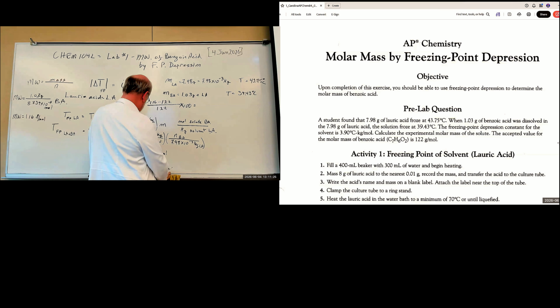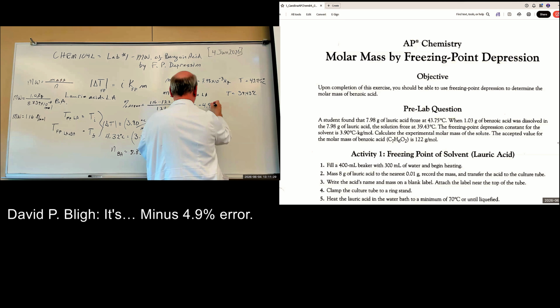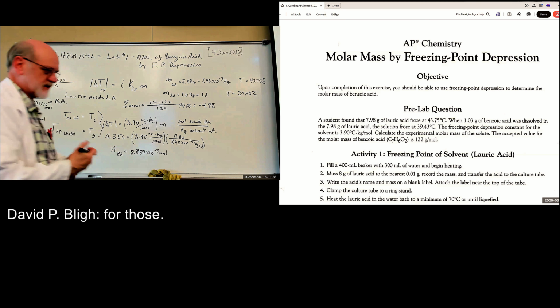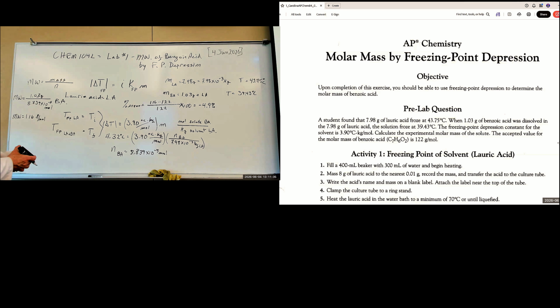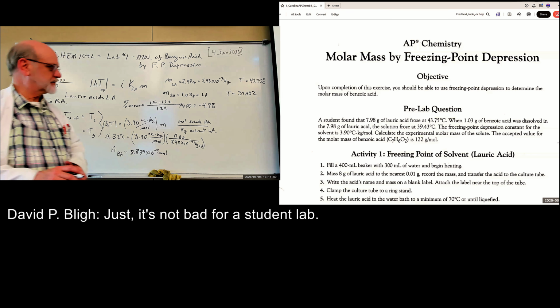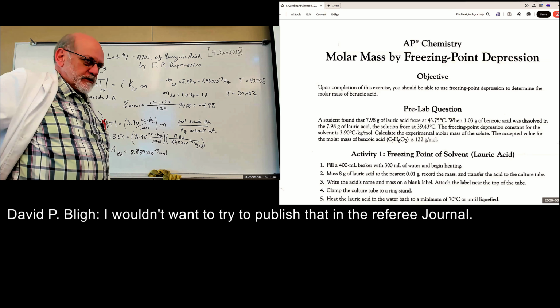It looked right. It's minus 4.9% error. Yeah, 4.9%. Okay. It's not bad for a student lab. I wouldn't want to try to publish that in the referee journal.